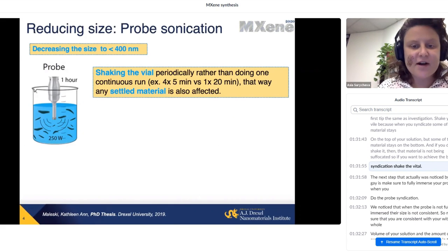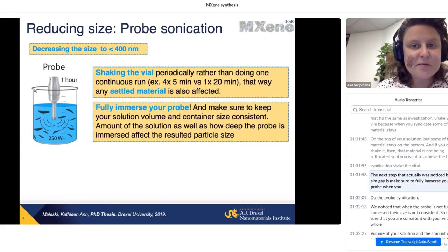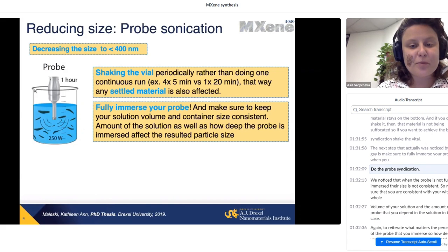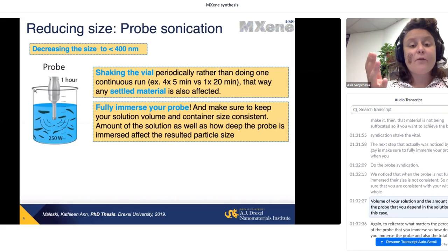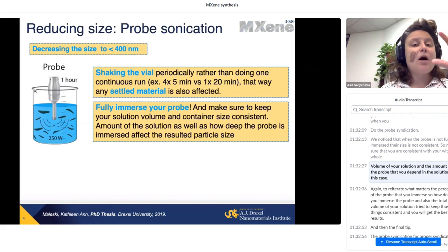Sonication, shake the vial. The next tip that actually was noticed by Simge is make sure to fully immerse your probe when you do the probe sonication. We notice that when the probe is not fully immersed, the size is not consistent. So make sure that you are consistent with the whole volume of your solution and the amount of the probe that you dip in this solution.